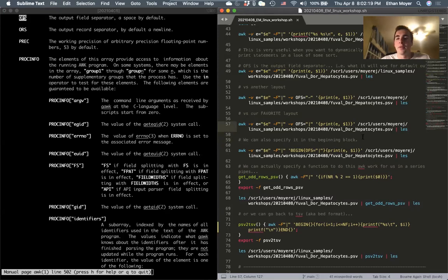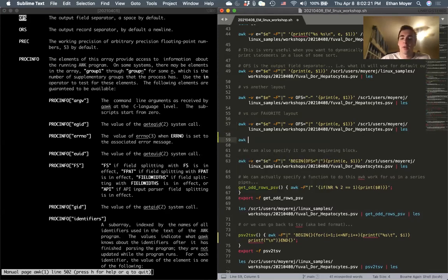So then if I were to do awk some script, file 1, file 2, it'll go through all the lines of file 1, and then it'll go through all the lines of file 2. And what I can do is I can say if FNR equals NR, execute this line. And so this block will only occur for file 1, and then I can be specific for file 2 if I do this. Basically, when they're different, execute it for file 2.